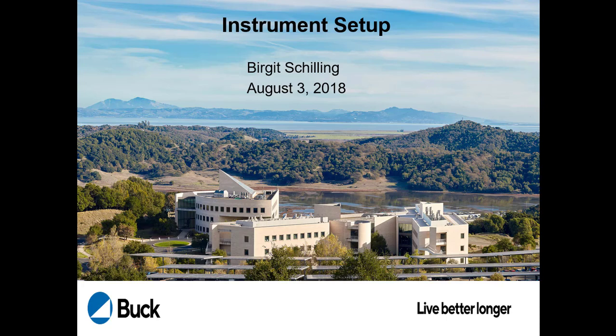So on a SciEx instrument, for example, TripleTOF 6600 or 5600, PRM is just a fancy type of DDA with an inclusion list where you always run that inclusion list and only that and nothing else. Because that's what you do, right? You do DDA of peptide 1, 2, 3, 4, 5, 6, 7, and then you start again. So they have the inclusion list and then have an IDA or DDA type method to do that. I'll show you that, but the SWATH is different, the windows, and I'll show you how they do it also. So this is our institute actually, if you're ever in the Bay Area.